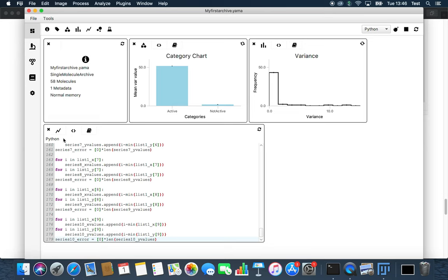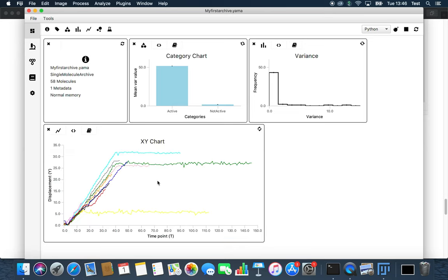You end up with a direct comparison of the 10 traces which were tagged as active.